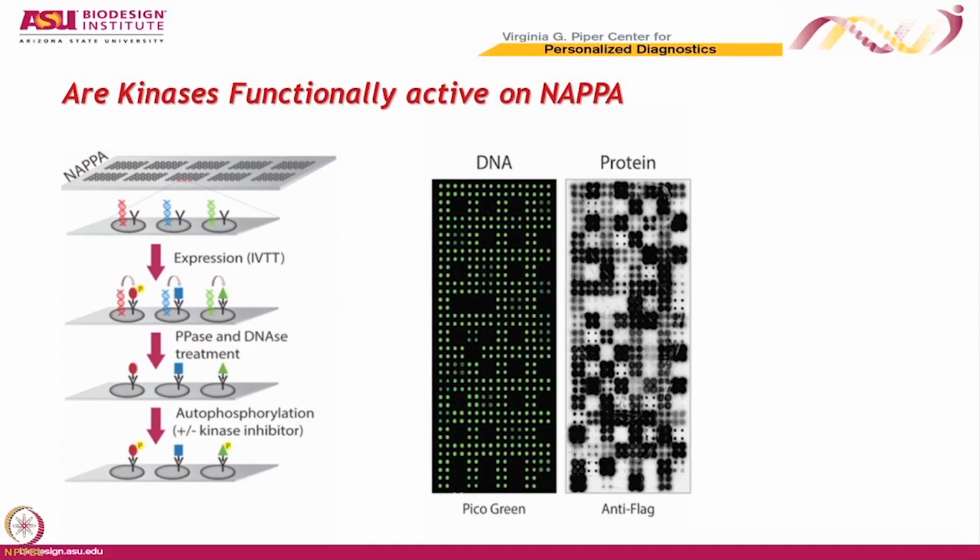And then here what we've done is express the proteins and then stain them with an anti-FLAG antibody. And the reason it's a FLAG antibody is in this particular circumstance, these proteins, which are all kinases, happen to have the FLAG tag and not the GST tag.